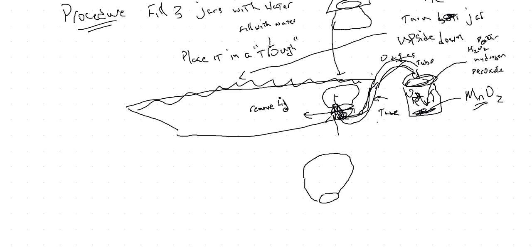There's this hole here that's connected to the O2. So in here is the O2 gas, and it's going to go in the jar. And as O2 gas fills up the jar, the water is pushed out.